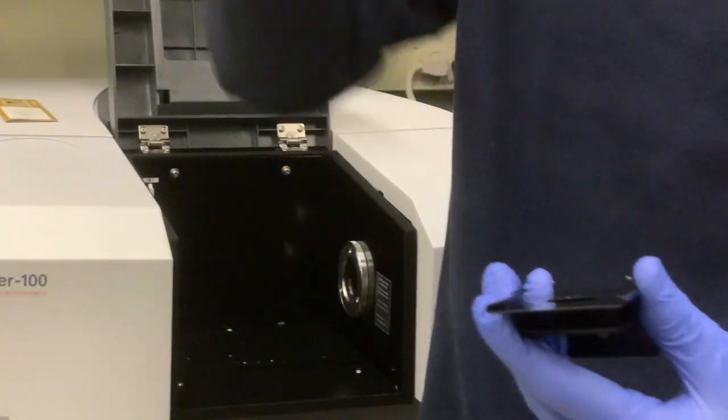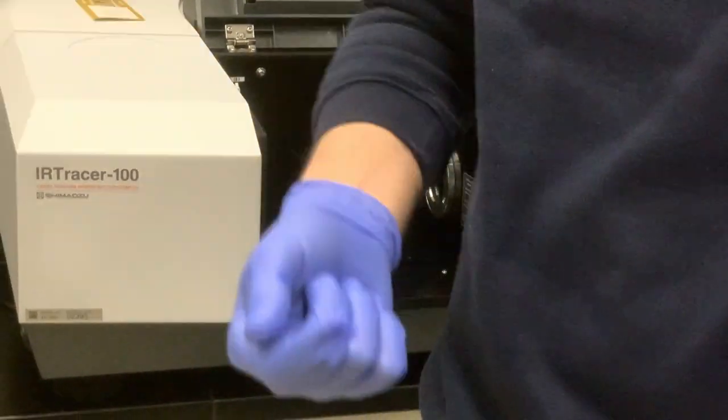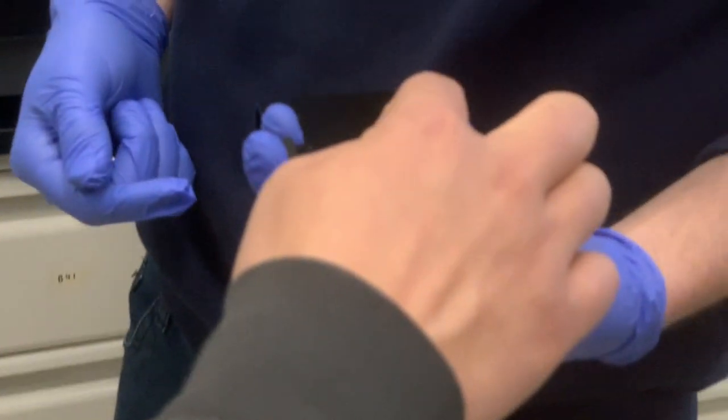It takes a long time, so I'll just put one sample and use the tape, then remove the tape and put another sample. There should be something to put it. But anyway, the infrared only penetrates through this circular area.